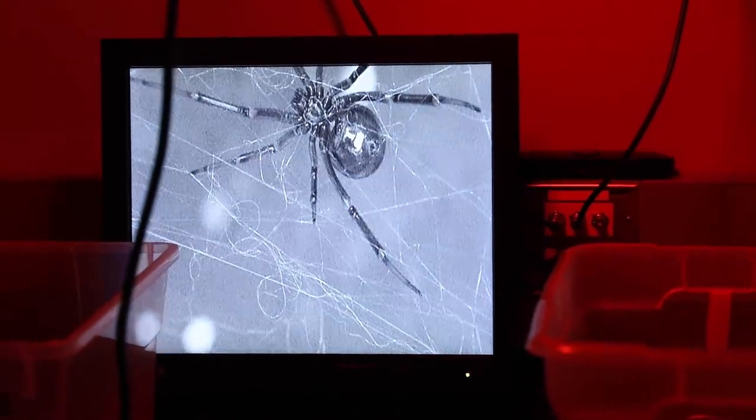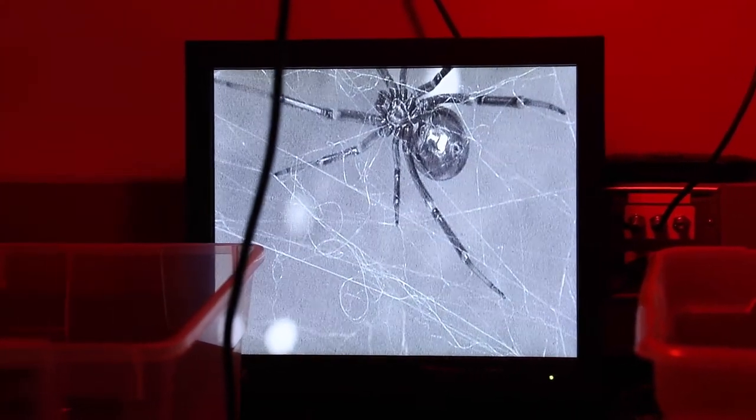Females are put in containers that contain water and they build their webs on little frames that sit in the water. That way it's like they're on an island—they can't get across the water bath and so they're constrained onto the frames where we put them and they build their webs there. We can focus on them from above and get a good picture of what's going on with the matings.